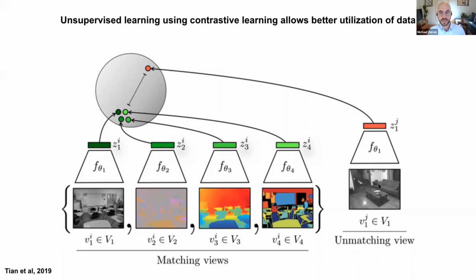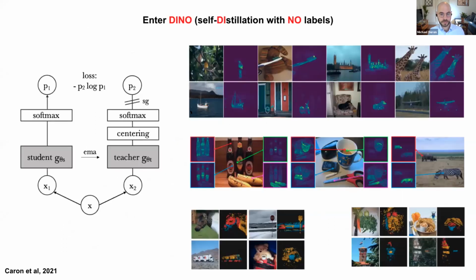This allows us to actually learn a compressed version of the images, of the samples, without having any labels for them, only the data itself. We will use a specific model published recently by Facebook, which is called Dino, for self-distillation with no labels. The interesting thing about this model, apart from the fact that it uses self-supervision, is that it uses vision transformers instead of convolutional neural networks. This allows us to extract better features when we have large amounts of data, which is what usually happens in experimental data and in unsupervised learning.